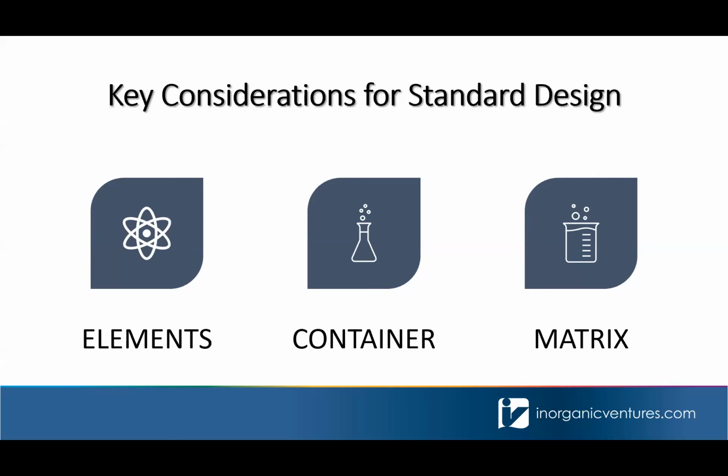For most of the information that I'm going to share with you today, these have been our lessons learned in our laboratory. As required by ISO, we have a stability program. I consider our stability program to be very robust, and we use the data that comes out of this program to create solutions that are considered to be stable by design.